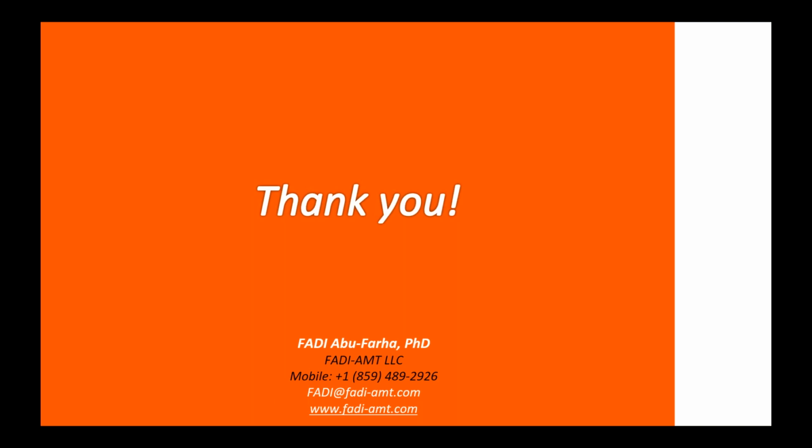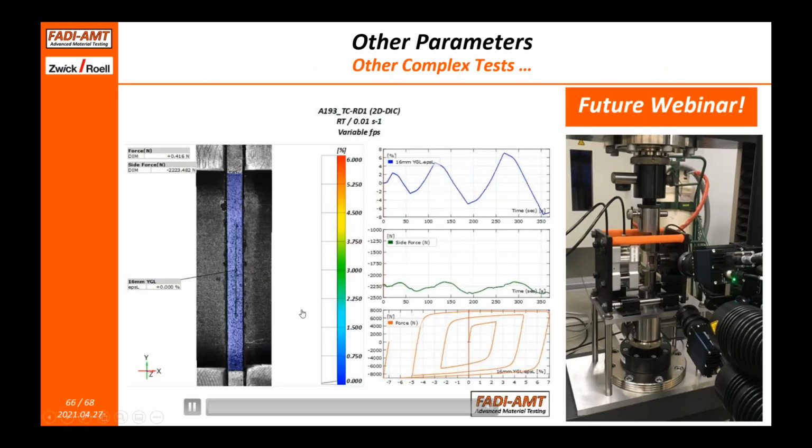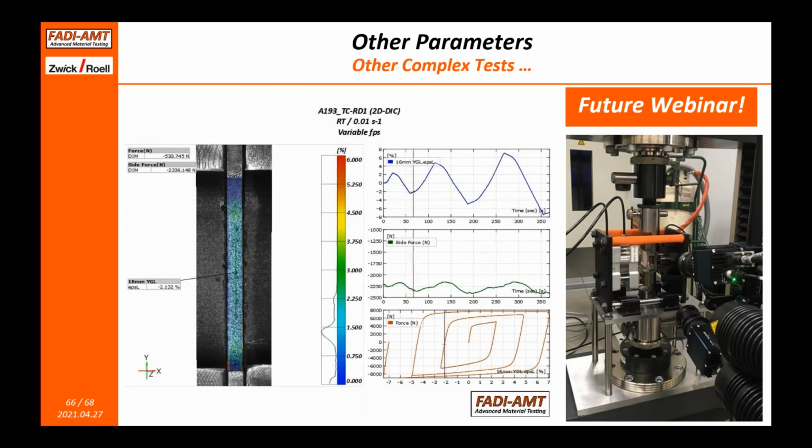Okay, good. Now a question about applications. How about fatigue testing? Do you think this technique could be applied to fatigue testing? We showed a very simple, not necessarily pure, fatigue test. The video I showed of this test is nothing but a tiny version of a fatigue test, because it's just a bunch of cycles up and down. So in essence, the answer is yes. This is just an example of how it could be done. Of course, fatigue testing is done at much higher frequency with smaller amplitude of load. This test has a much lower frequency with a higher amplitude of load. But the principle is exactly the same.